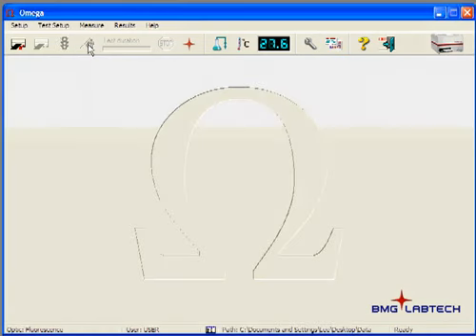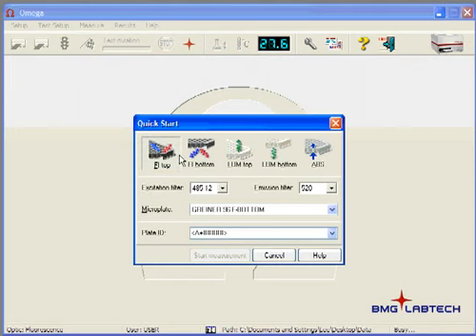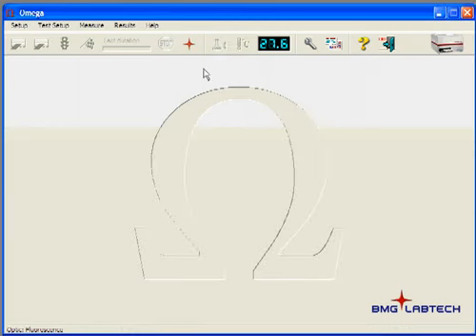The Greenlight is a quick start method that allows you to choose from several basic settings for modes. Choose the filters, both emission and excitation filter sets, which plate you're using, and a plate ID, so that you can very quickly run through and run a plate without having to know much about it.